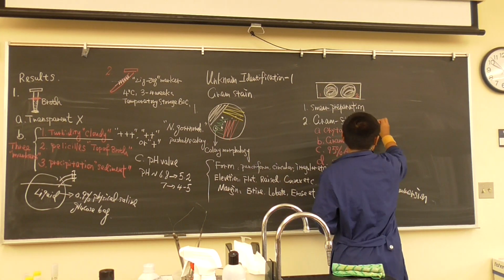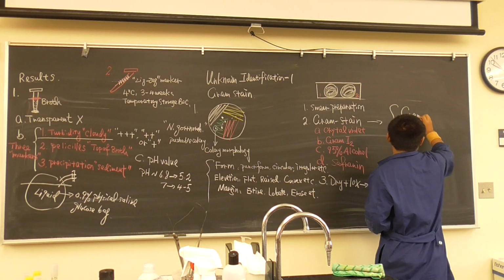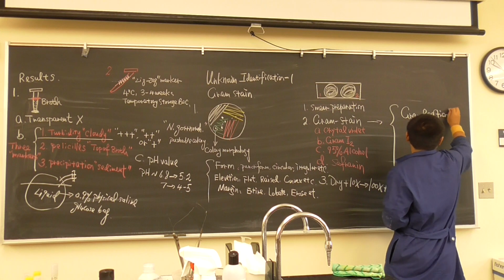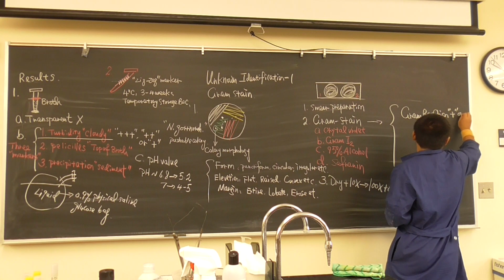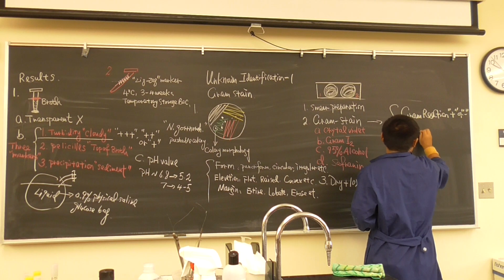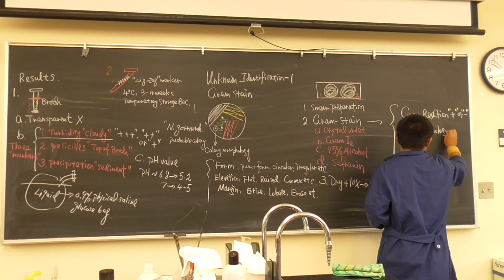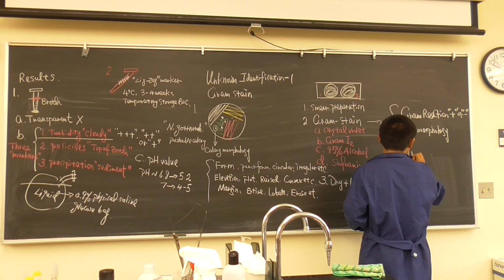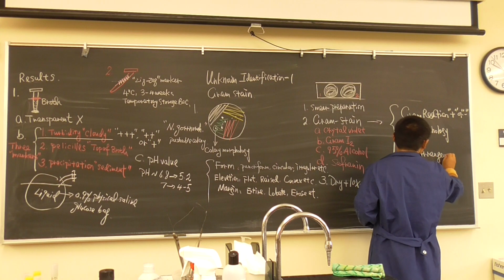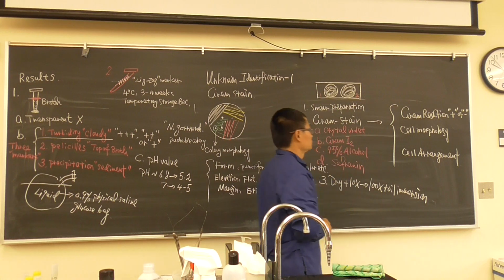What are the 3 pieces of information we should record? Always remember the Gram reaction, positive or negative. Everybody knows this, but don't forget about the cell morphology: coccus, bacillus, vibrio, and the cell arrangement. It could be single, tetrad, or different coccal arrangements, or it could be sarcinae.